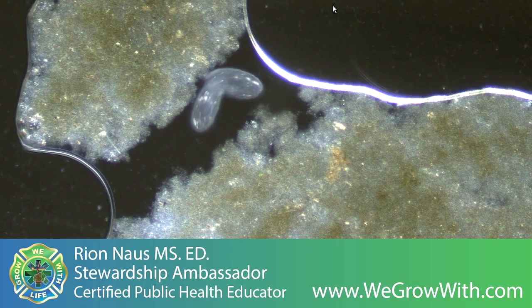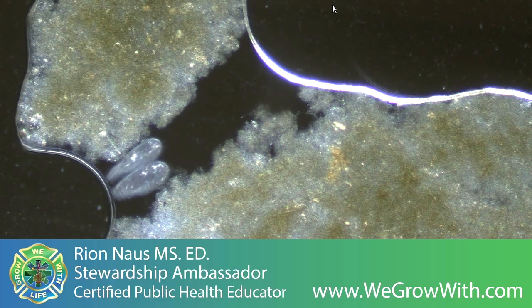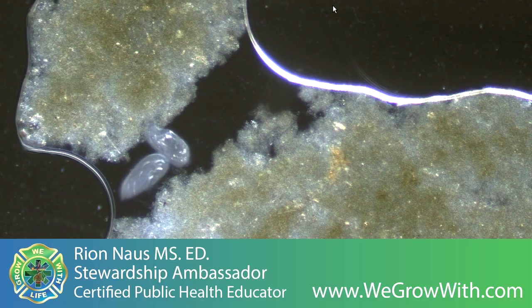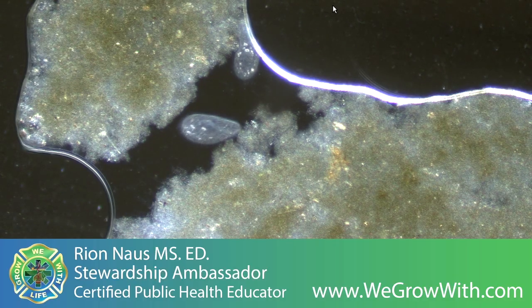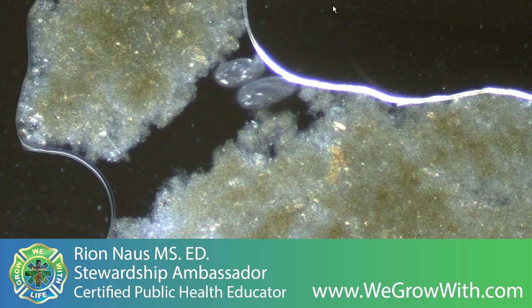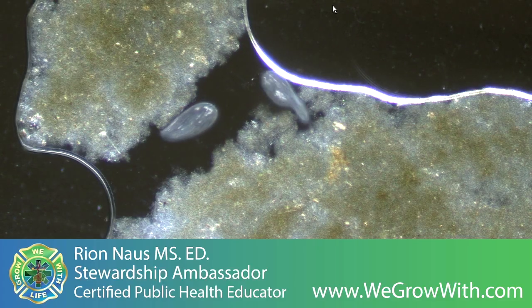But you can see the amount of energy that has been released into this system. Oh, look, there's some. What was that? Oh. Very cool.